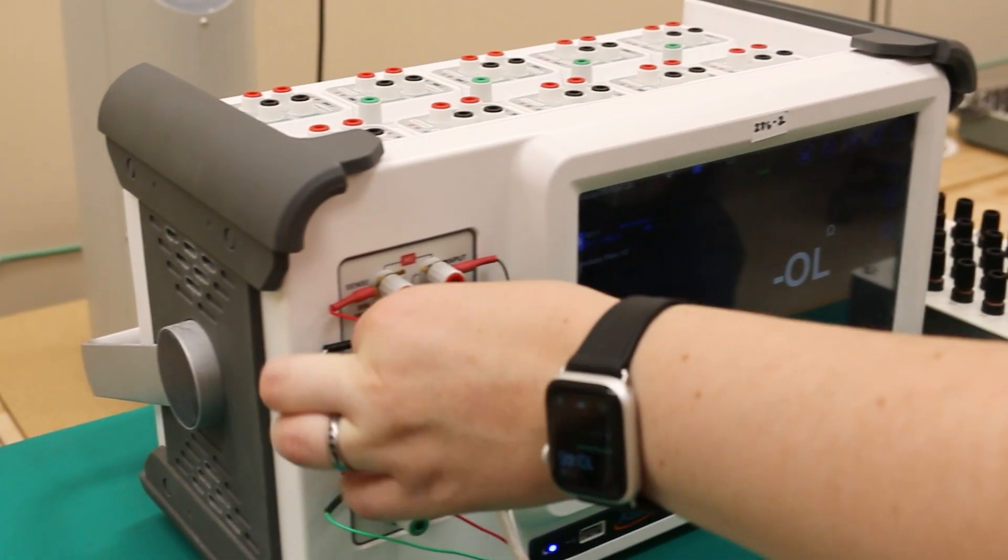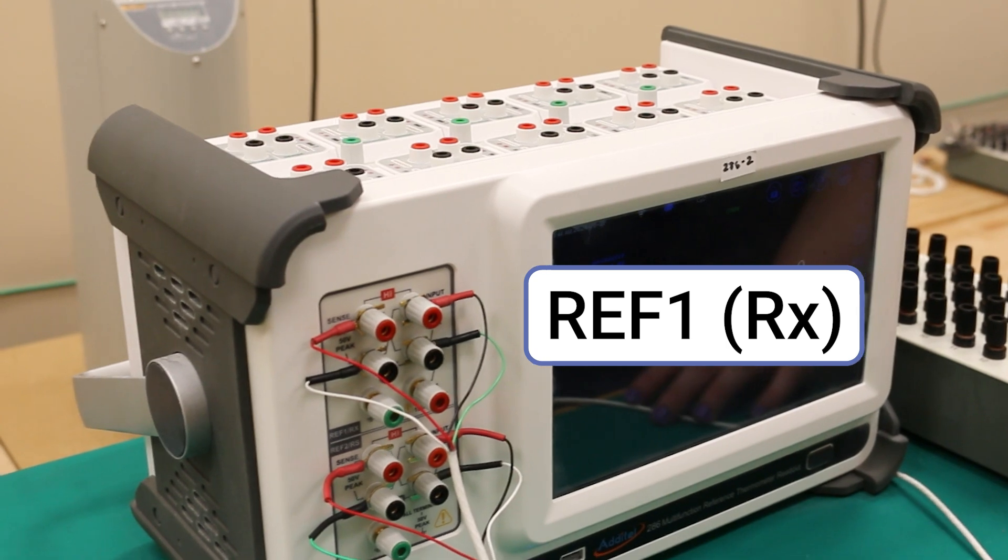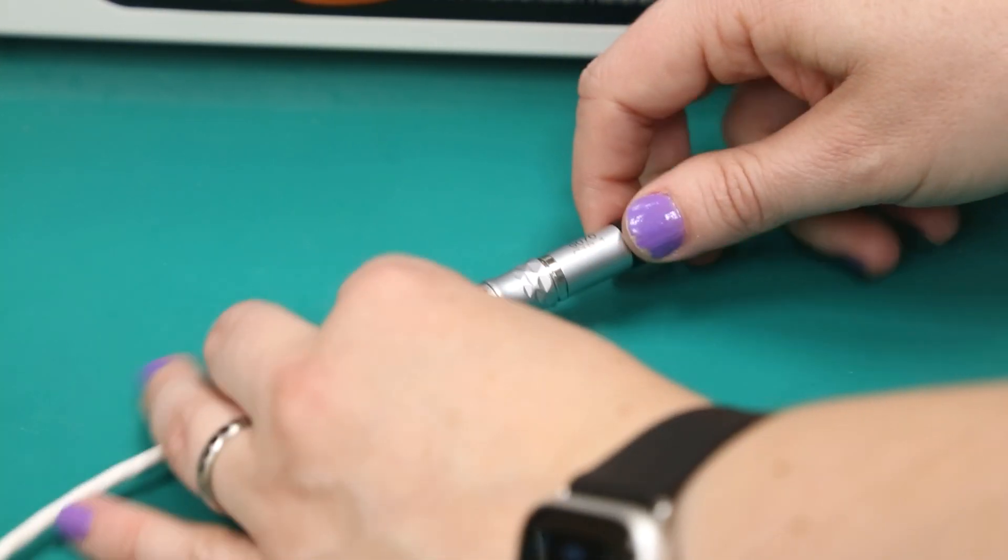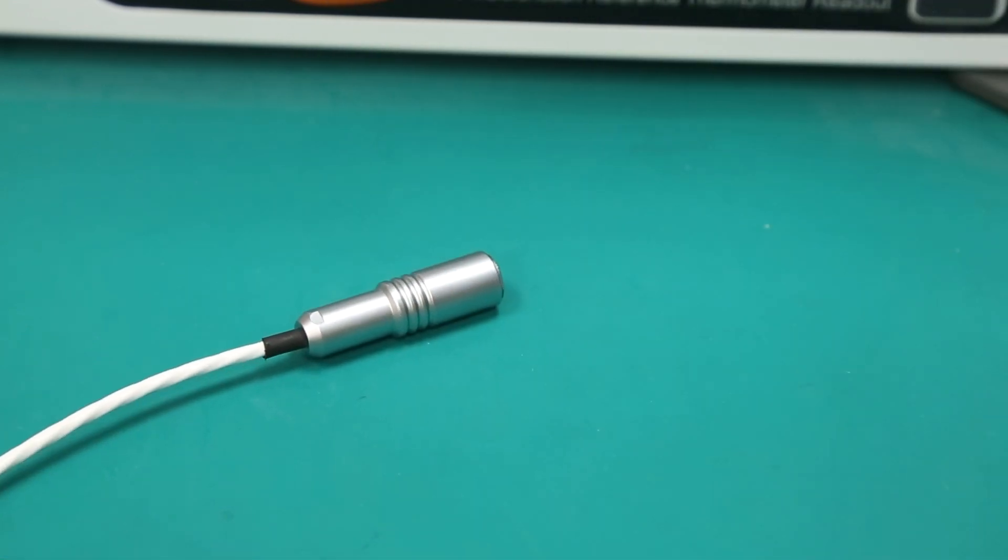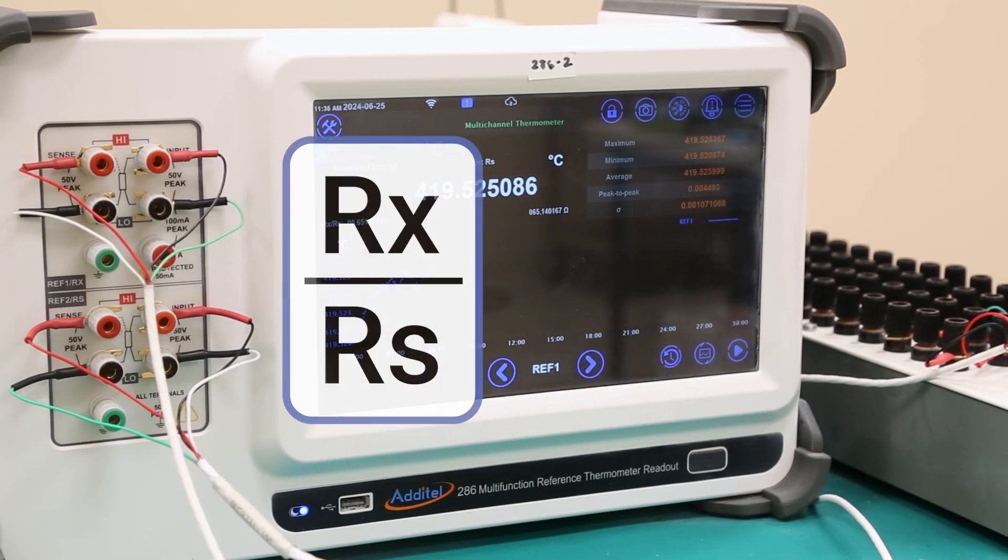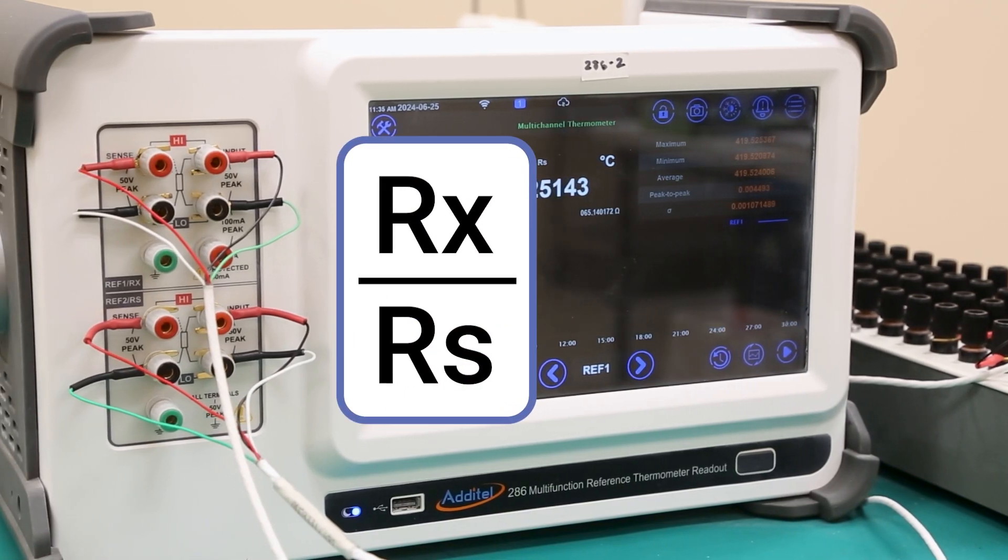Next, we'll connect a four-wire cable to REF1. Since all the DUT probes being used have the same quick connector, we will be able to easily swap them out without disconnecting the four-wire connection. While in bridge mode, the 286 will measure the resistance ratio from both reference ports.